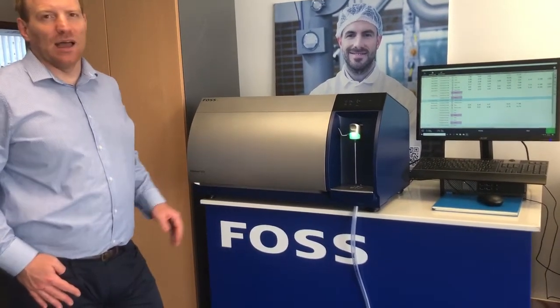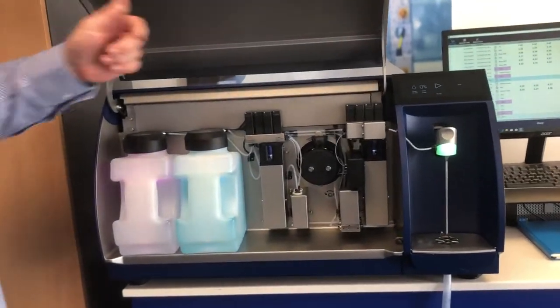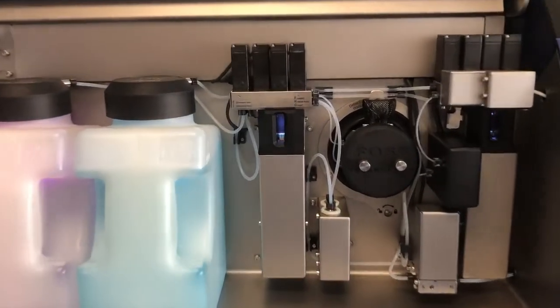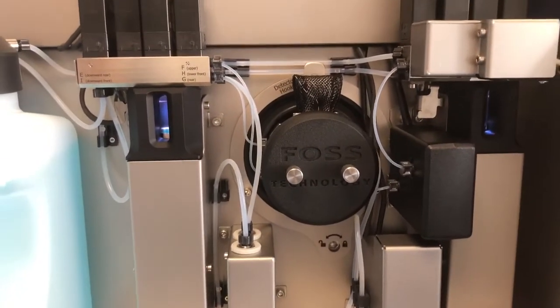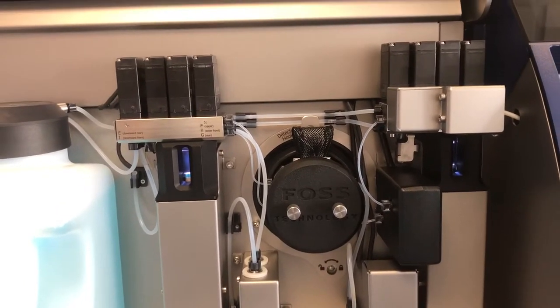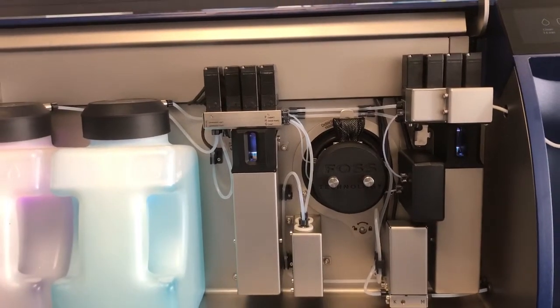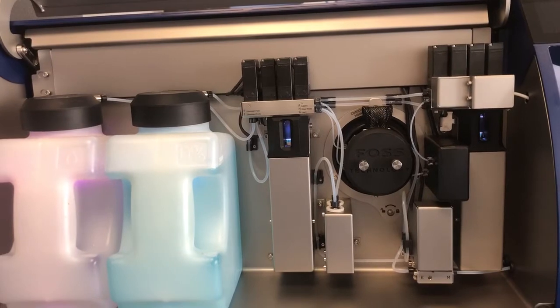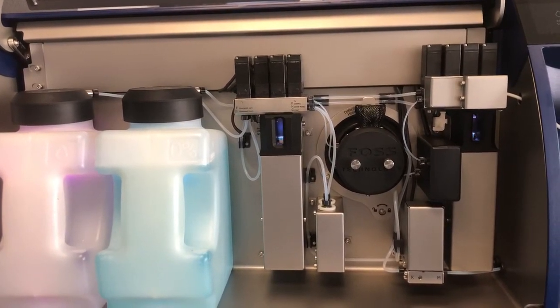The new instrument has an intelligent flow system now based on two syringe pumps to pump products through the cuvette. With syringe pumps we can cope with much more viscous samples, and we don't get any homogenizer wear. We don't need to standardize the instrument or equalize the cuvette.